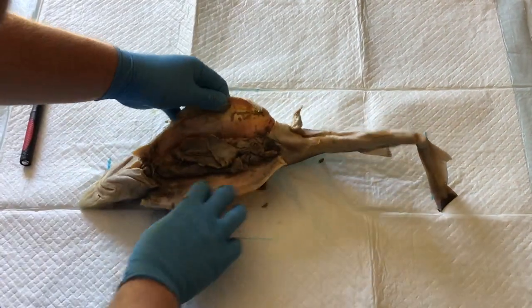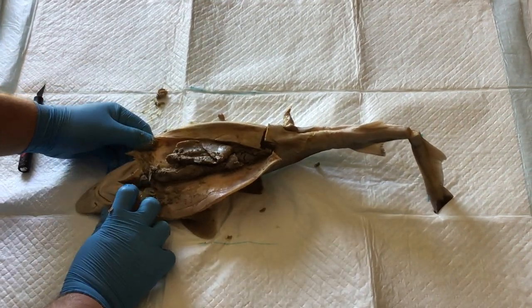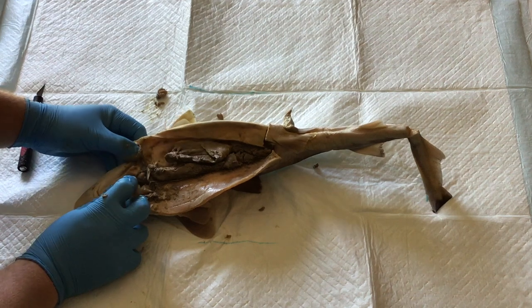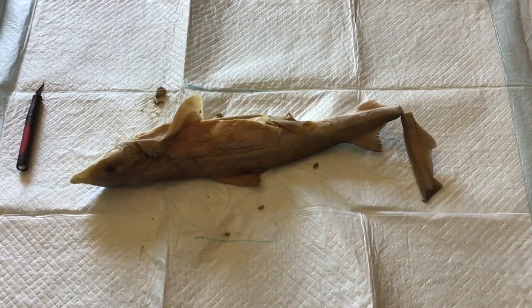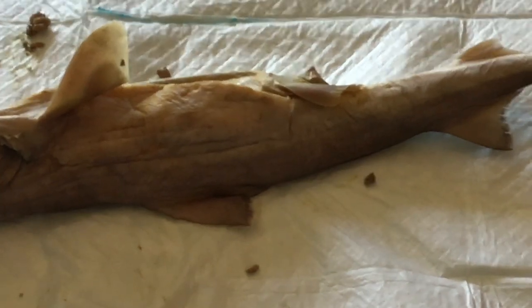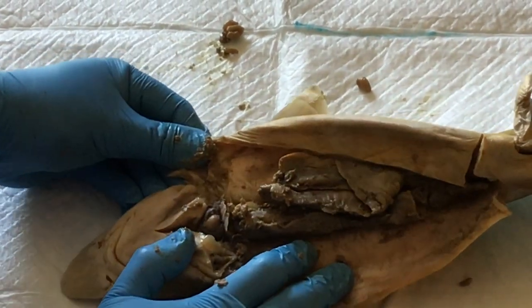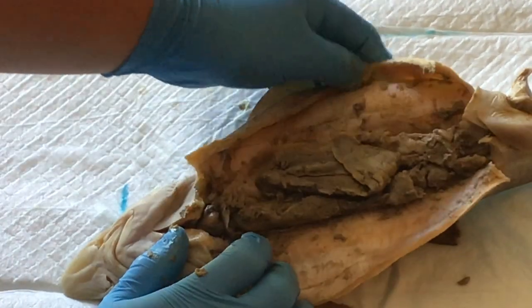Okay. What you're looking at in here is you can see a few things. This shark is a very small one, so it's not going to be very easy to show you. But the first thing you can see right here is the heart. The heart is located near its gills, and the gills are what help it to breathe. I'm just going to shift my camera up a little bit so you guys can see this a little bit better. Okay, so when you have the heart, obviously your heart is going to be near where you breathe. Since its gills are located near its mouth, its heart's going to be near its mouth.